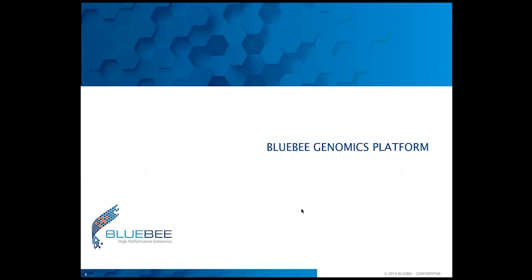Thank you, Ekaterina, and also on behalf of Bluebee, welcome to everybody to this webinar. Before we go to the demo, I would like to give you a little bit of background information on what the Bluebee genomics platform is about, and then we'll focus on how you can use the Bluebee platform in conjunction with your LEXOGEN QuantSeq kit.